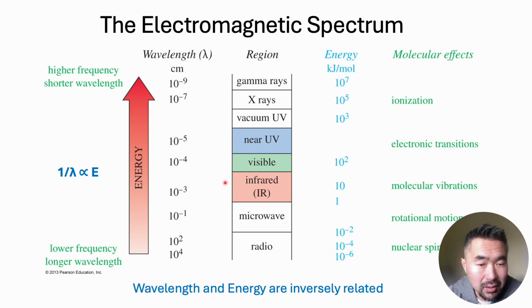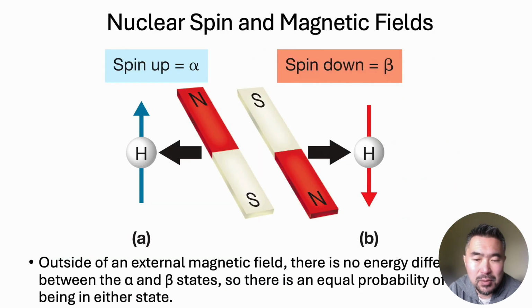Earlier we talked about IR spectroscopy. NMR depends on the radio wave, a much weaker strength and much longer wavelength electromagnetic radiation. It's literally the same wavelength that radio signals are transmitted over. Okay, and so that's the NMR here. It's much weaker energy that's transmitted.